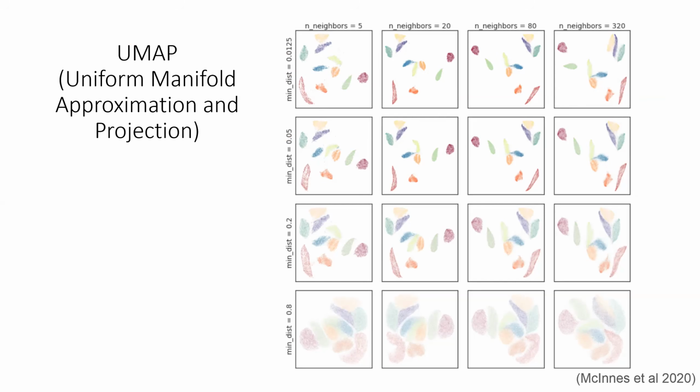So they don't represent treatment or not treatment. You can do this when you have treated and untreated groups, if you pool all the data together, or you can do it separately. In general, they're used for plotting known marker genes and then seeing how that corresponds to your cell type clusters. So you can label the cells according to the expression of a gene of interest or what cell type cluster they belong to, and then compare the overlay of that visually to have a sense of what your clustering algorithm is doing.